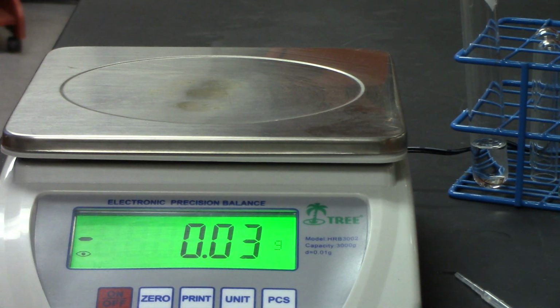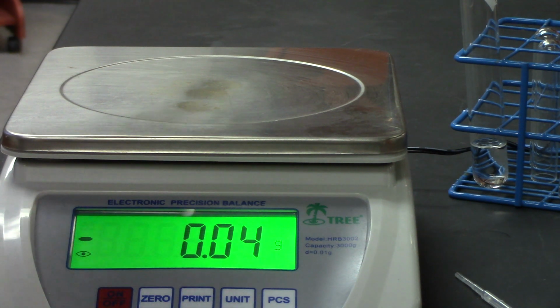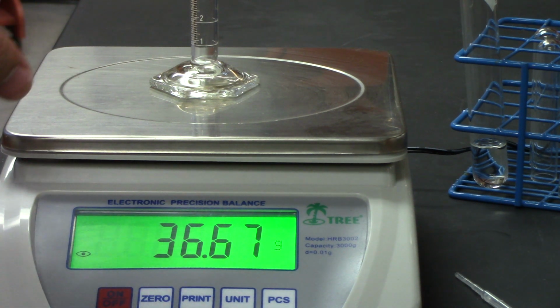So what I want to do is weigh my unknown in the graduated cylinder, but I don't want to have the graduated cylinder's mass. So what I'm going to do is put the graduated cylinder on the scale, and get rid of the mass of the graduated cylinder, and then add my unknown to it, so the amount I add only measures the mass of my liquid, not the graduated cylinder.